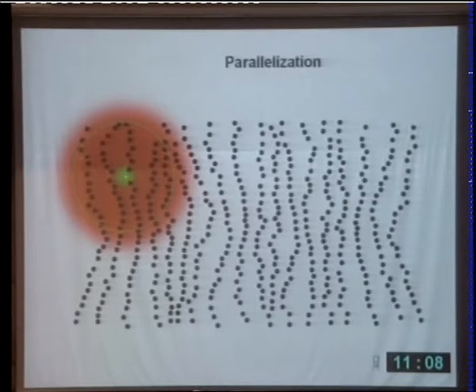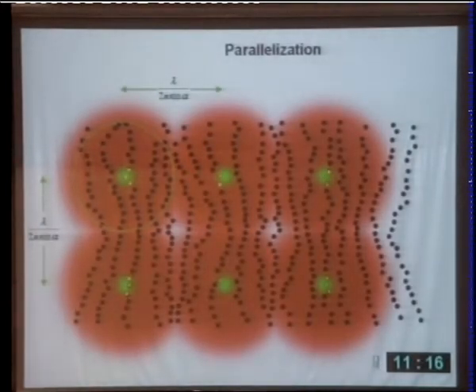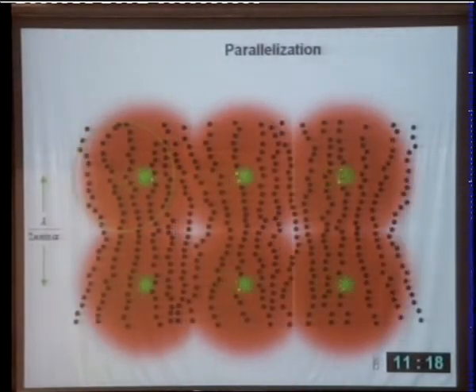Is there a way to improve the recording speed? Yes, you can parallelize things. As I said, the donut needs to sort out the features just within that 200 nanometer range. And so if we have many of them to parallelize the imaging process, we can be much faster, as you see here, and hence record with a CCD camera or something.